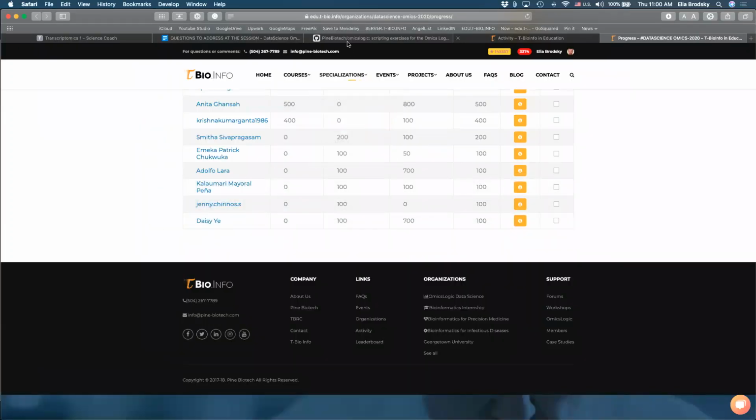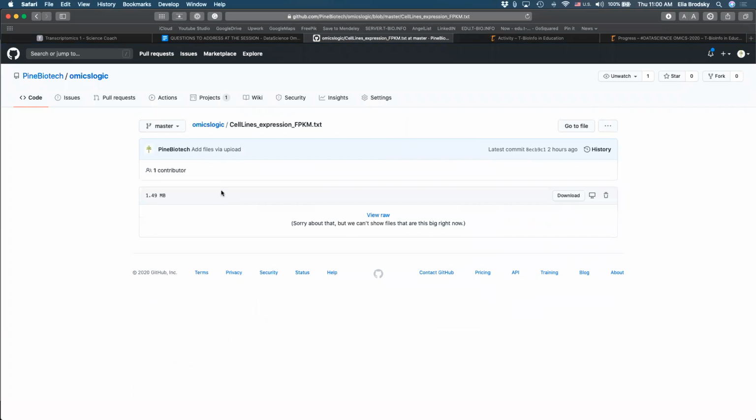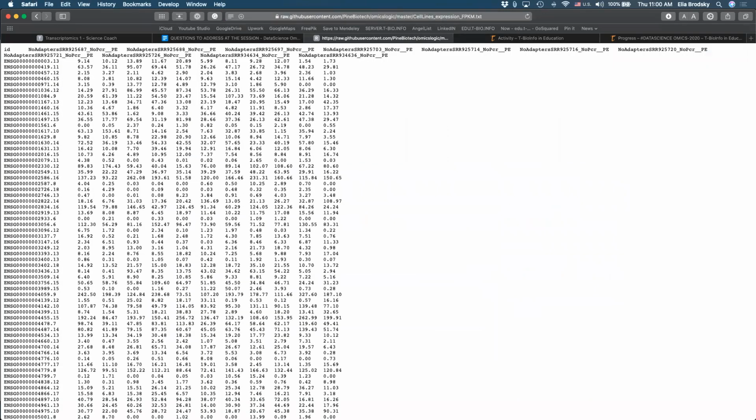Okay, so I'm going to give you a file. So let's use the cell lines expression FPKM. Okay, so you can use this file right here.